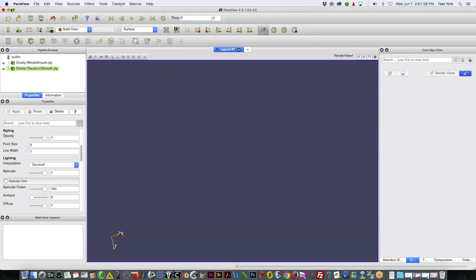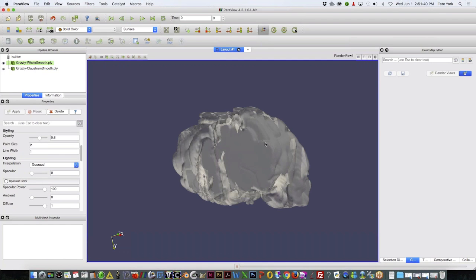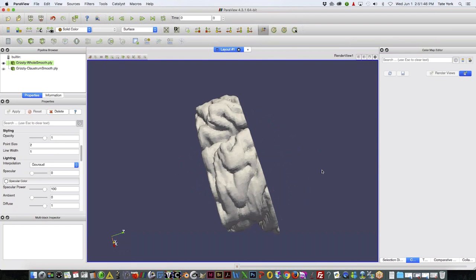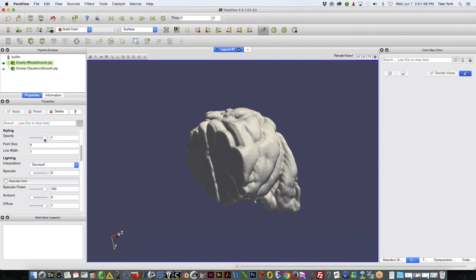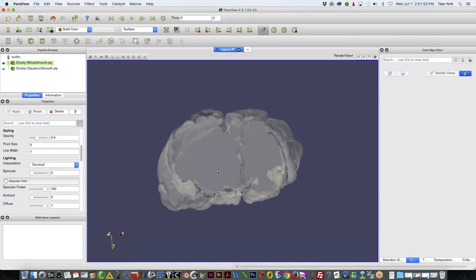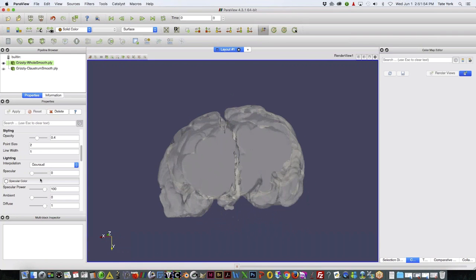All right, let's go back to the PowerPoint here. So that basically covers the 3D reconstructions, volumes and surface maps. The more images you have, the better reconstruction we can produce. And so, like I said, we found that every 6th section gets a very good number of images, for both large and small brains, to view.